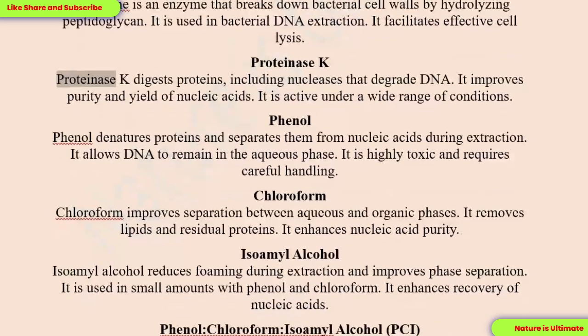Proteinase K. Proteinase K digests proteins, including nucleases that degrade DNA. It improves purity and yield of nucleic acids. It is active under a wide range of conditions.